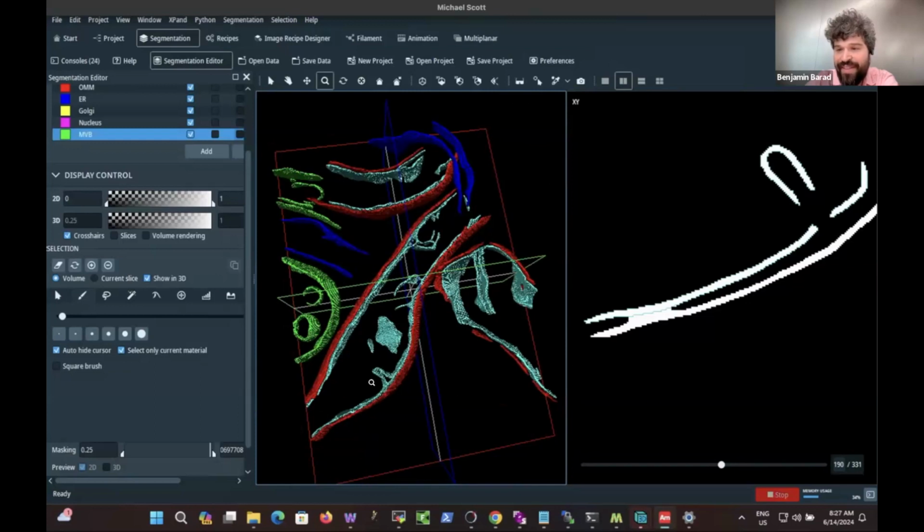This has been really fun. Thank you for inviting me out again to do this talk. I really enjoy presenting this to people that are curious about tomography and about electron microscopy. I'm really hopeful that this becomes a field that's very easy to enter. It's become much easier, but it can still be an intimidating thing to start doing. And hopefully, even if I didn't really succeed in showing you the segmentation going super smoothly, I made it a little bit less scary looking, at the point I was just driving around and painting. It's more of a Bob Ross experience.